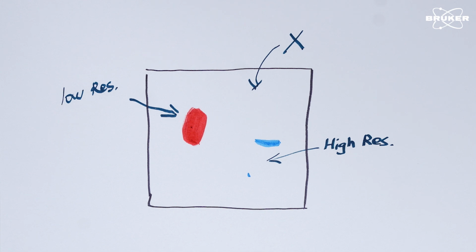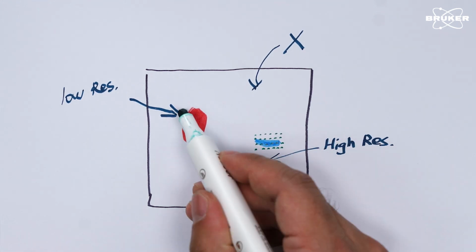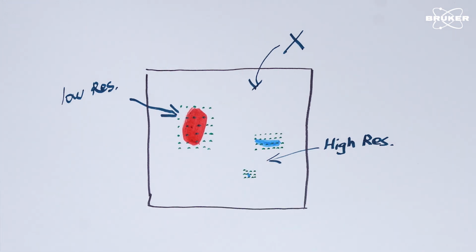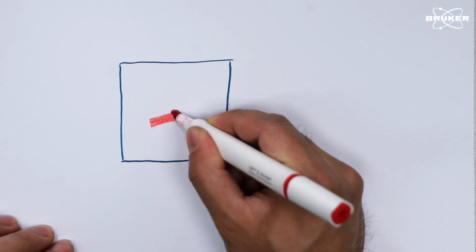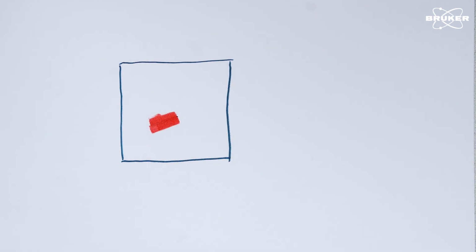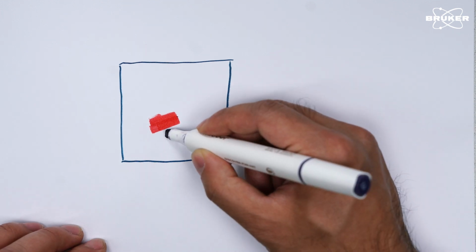If you can see these regions clearly on the optical microscope, it's easy to set up a Raman map with different parameters for each area, keeping your experiment short and efficient. But what if you are relying on the Raman signal to find your target, like searching for a specific material? Now it's like a treasure hunt.